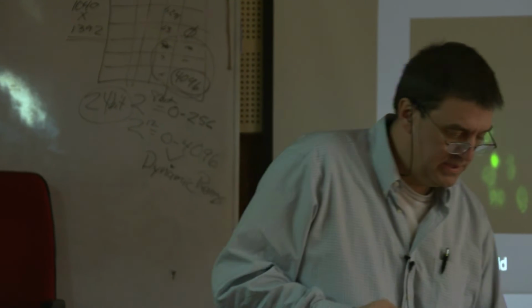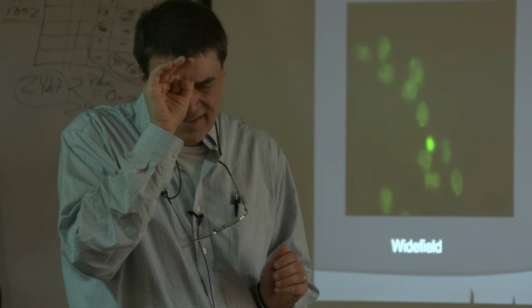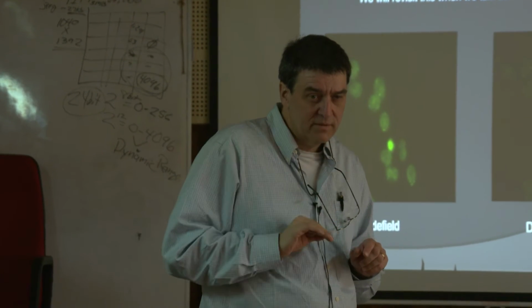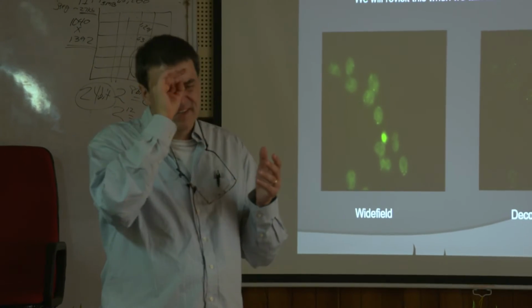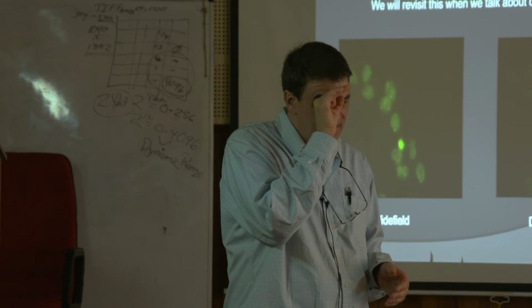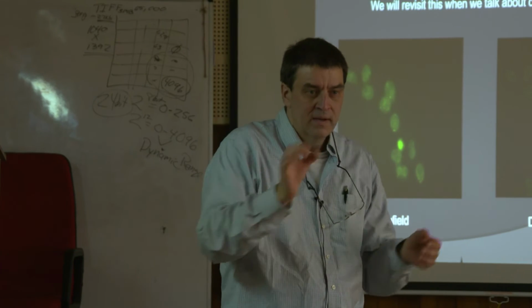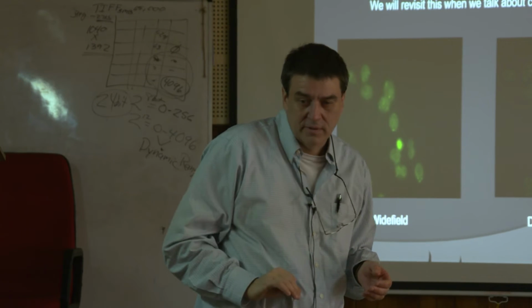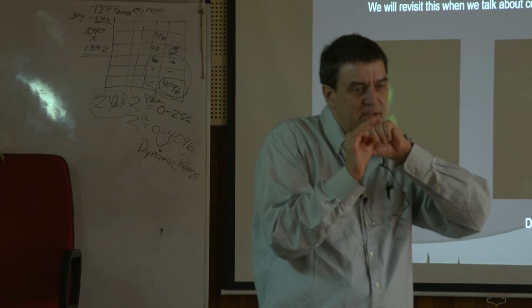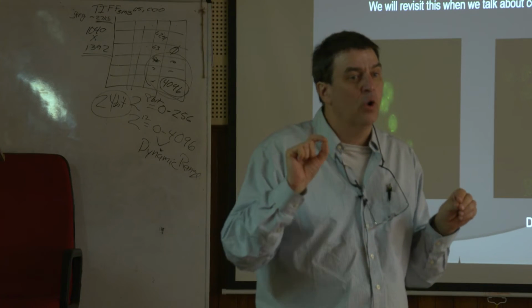Did you ever do this? Like you make a little hole with your hand, and you look through it? Do it right now. Just take a look. What's it look like? You see it's a little cleaner, right? You don't see the whole room, but what you're looking at looks just a little bit sharper. You're using your finger, making a little hole, a pinhole. On a confocal microscope, there's a pinhole.